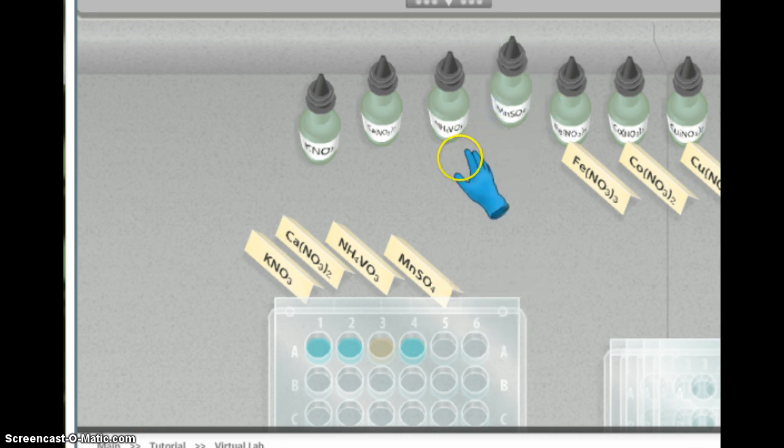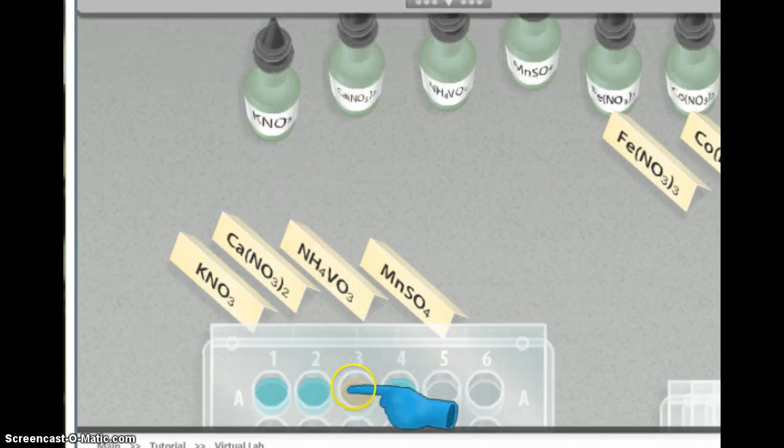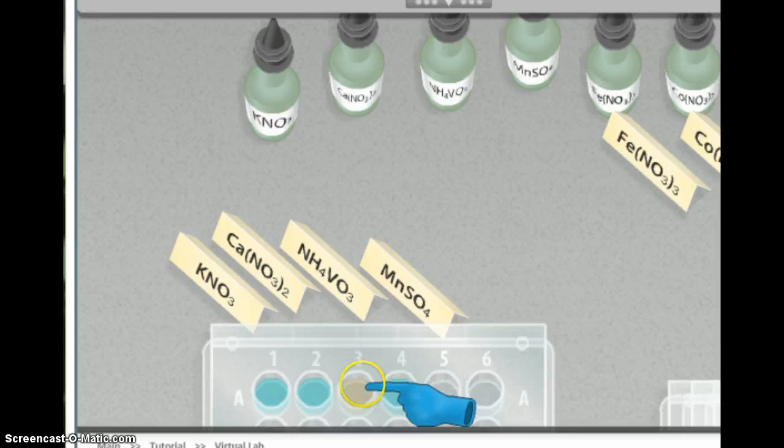All right, so now we're going to do our first set of observations. So this is what the chemicals look like by themselves. So these are our control. All right, so we see that 3 of them normally are light blue, and that one, depending on your screen color, let's see if I can make it a little brighter, I would go with it's kind of brownish. If it looks a little pinkish on your screen, that's okay. Point is, we can tell that it's obviously different.